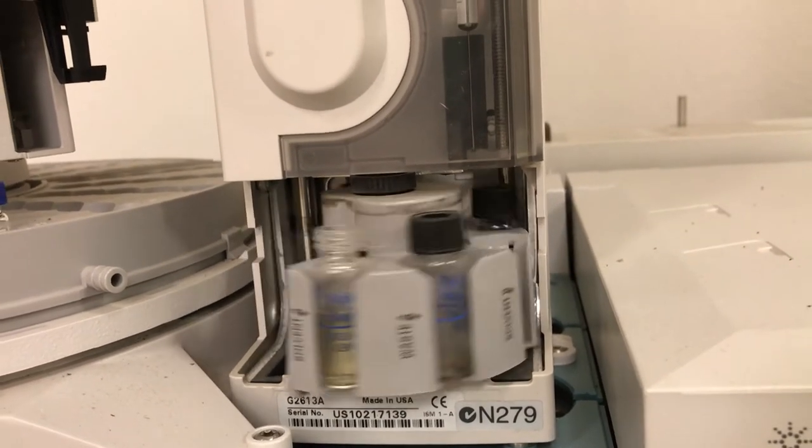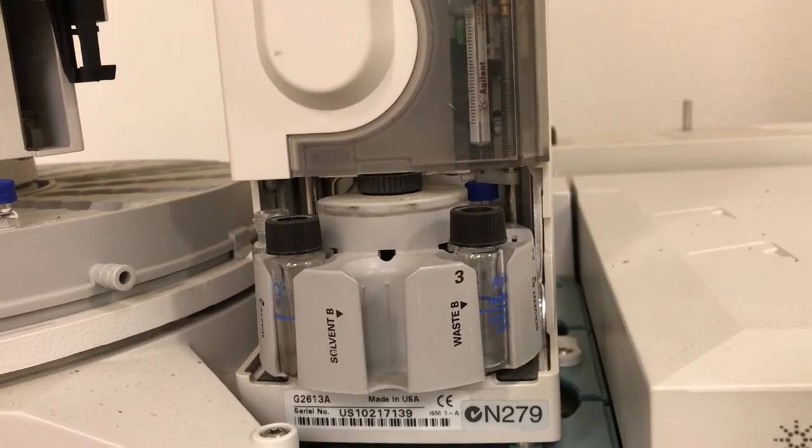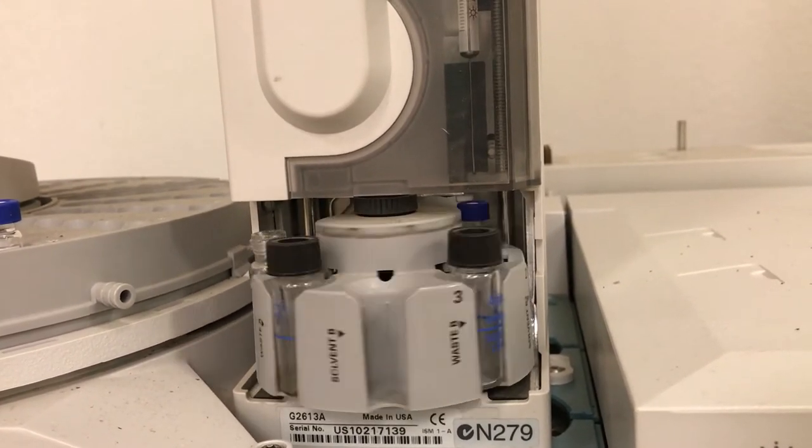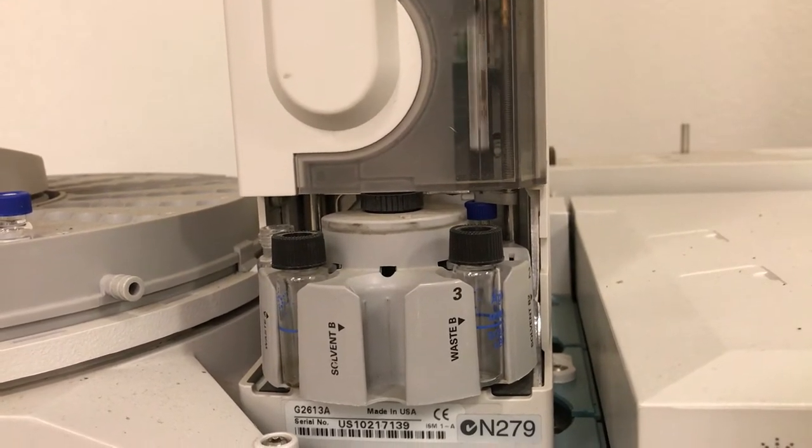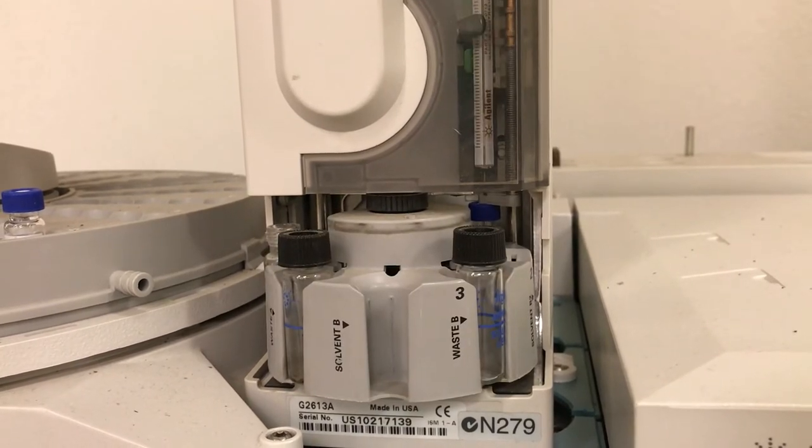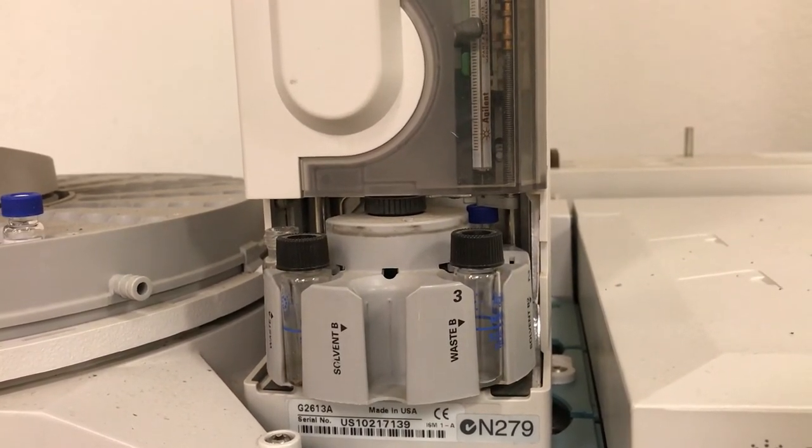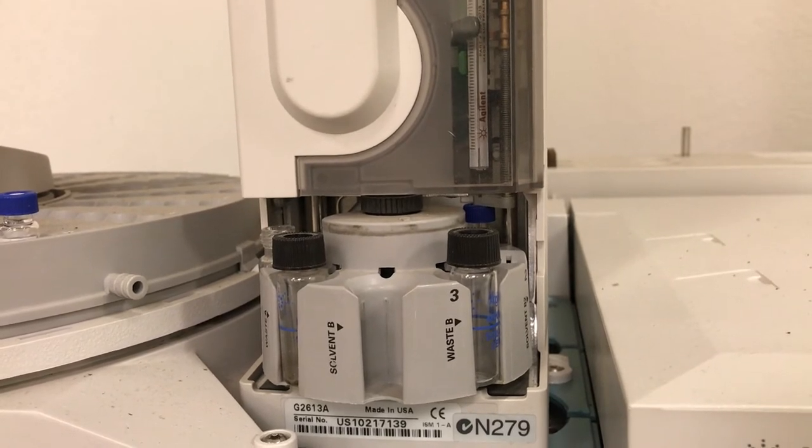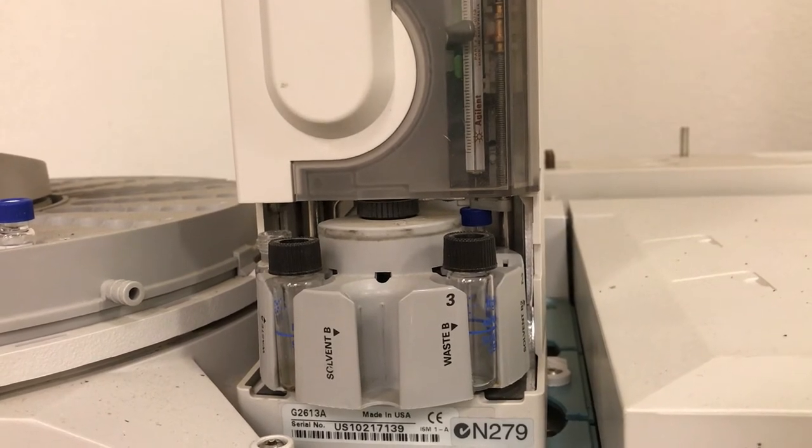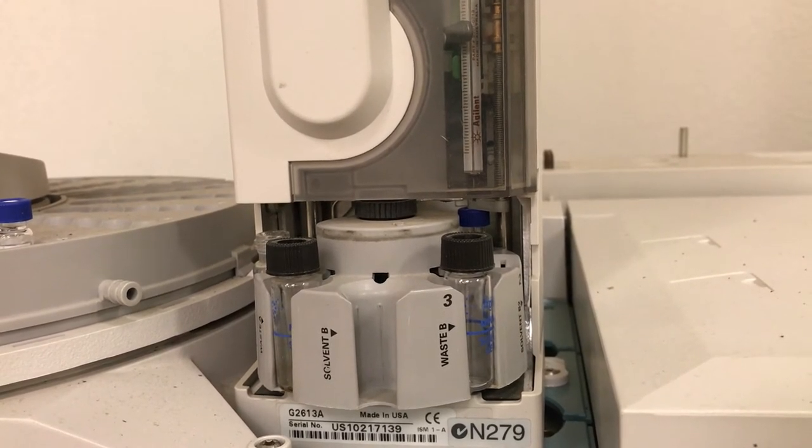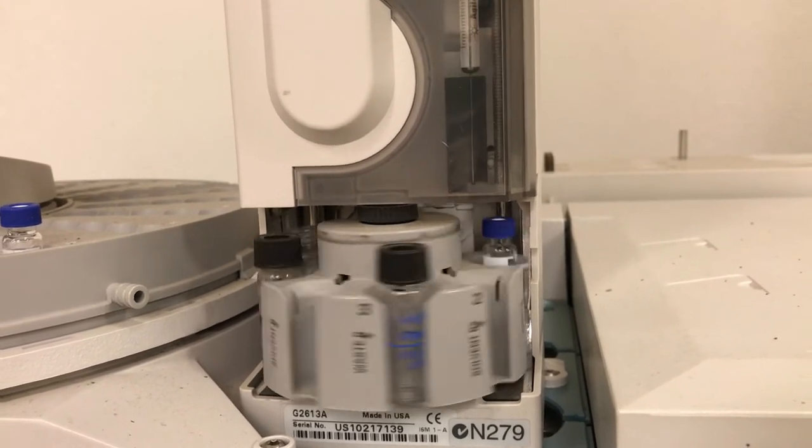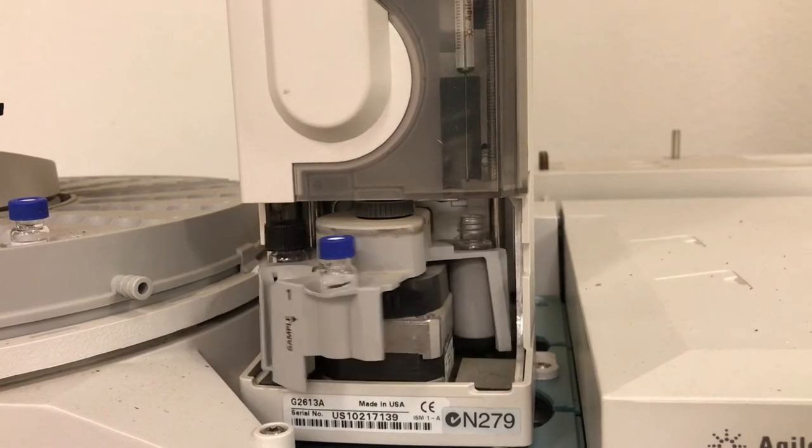So first what's going to happen is it's going to pull up some of my sample with that needle, you see it. It pulls up a little bit and then spills it out into a waste container and it does that twice to rinse the needle in case there was some leftover from the previous run. Then it shoots it out a couple of times trying to get rid of some air bubbles and then it's going to pull up just a little bit, about one microliter of sample. There it is, so that was just the injection.